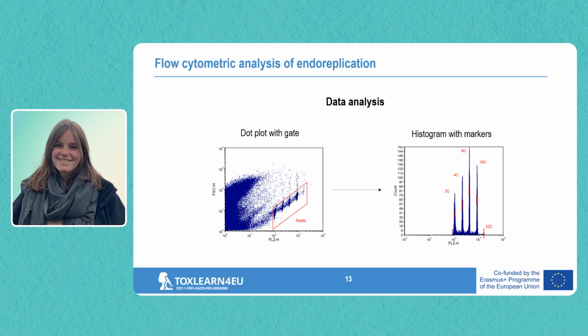However, what's very nice is that over here, I hope you can all nicely see that, we have 4 or even 5 of these clusters. You see these thicker stripes, let's say, and these actually represent our nuclei. And each of these clusters represents a group of nuclei corresponding to one specific ploidy level, so one amount of DNA. So we know that these are our nuclei.